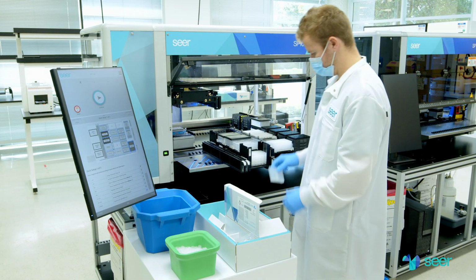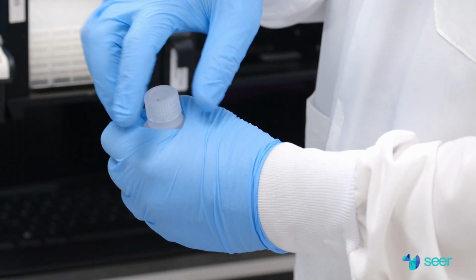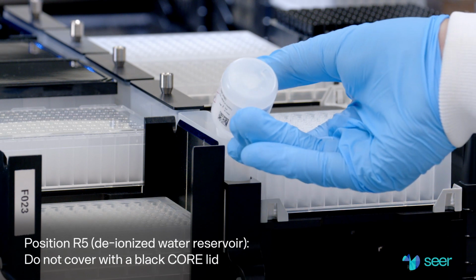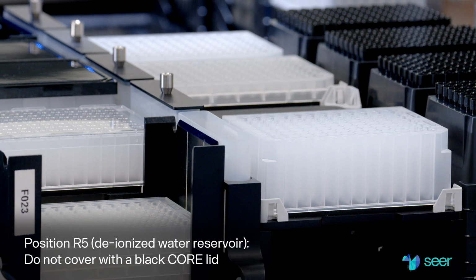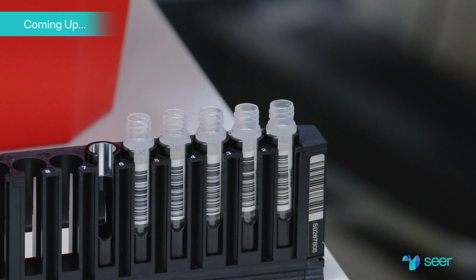Place the deionized water reservoir into position R5. Pour approximately 20 milliliters of deionized water into position R5. Do not cover with a black core lid. We have loaded the plasticware and reagents into the SP100. Next, we will prepare and load the nanoparticles and samples.